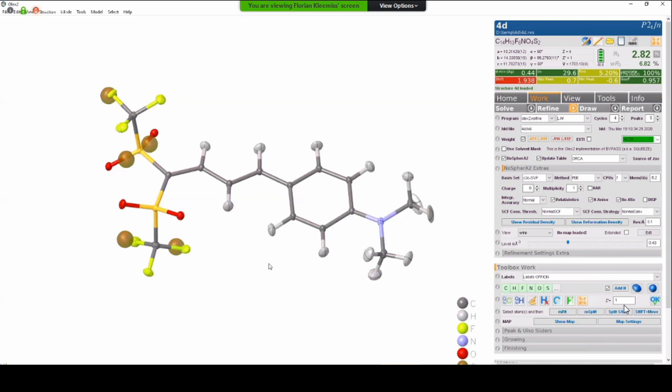So if you want to, for example, keep the angles between atoms fixed, but not the distances, you can use AFIX 22, for example, for a CH2 group. I might come to this point later. So then you need to disable this, but in the first calculation, why not try and see whether your data set can handle free refinements?